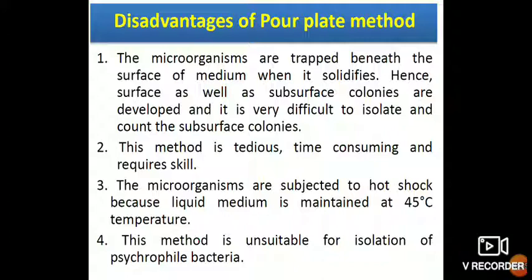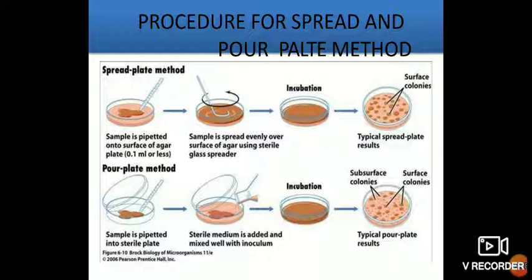So this method is unsuitable for isolation of psychrophile bacteria. Psychrophile bacteria means the bacteria which live in extremely cold conditions; they cannot tolerate a shock. Okay, so that is a disadvantage of the pour plate method. So, the procedure, just mentioning the pour plate method.